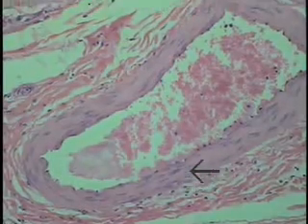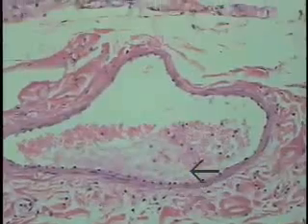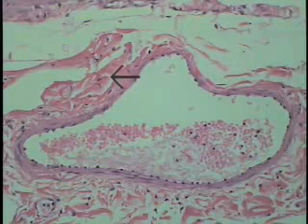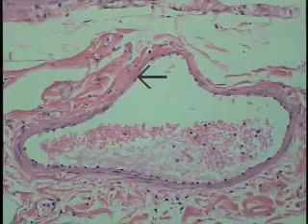Once again, retracing our steps, looking at the caliber of vessels, this is a slightly small artery, an artery of larger caliber, I should say, and with it, as we saw earlier, its companion vein. But in this particular case, just due to the sectioning, one can make out the media coming in, making up a layer of smooth muscle cells as it's cut at the right angle, so these are much more visible. Goes to about this far, and one can see with these open spirals you have gaps in the venous wall. In this particular side, the smooth muscle wall appears, or the media appears to be missing, and you mainly have a supporting collagen adventitia giving support.